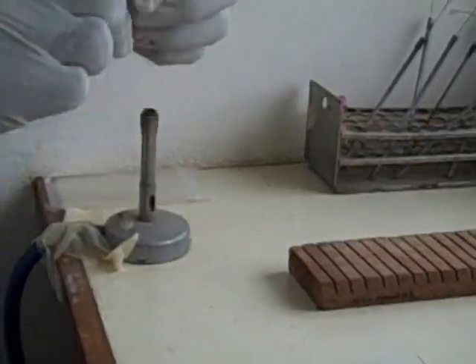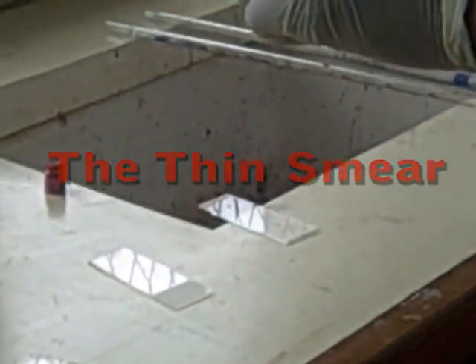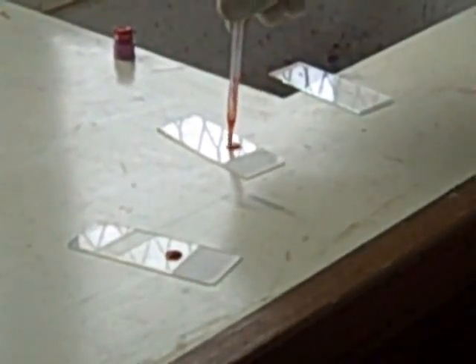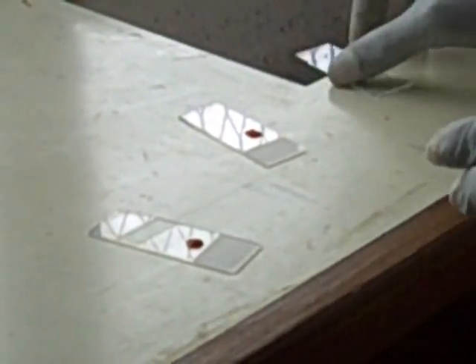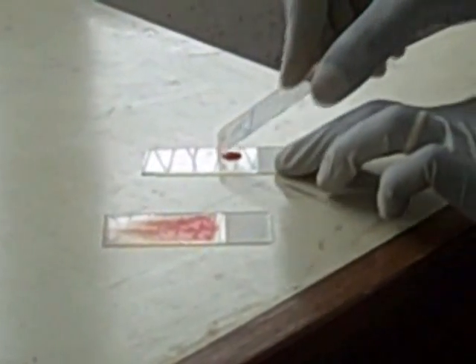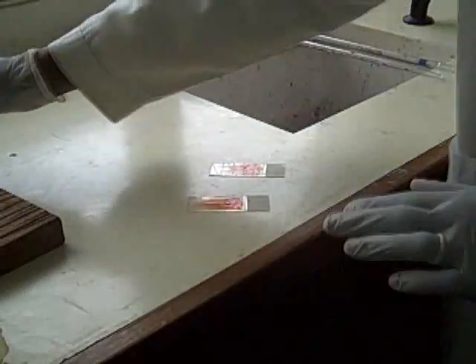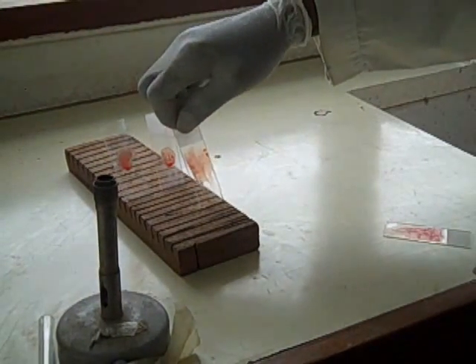Take a venous blood sample into a sequestrated bottle. Mix very well and take a drop onto a microscope slide. You can also take a finger prick from the third or ring finger. Using a microscope slide as a spreader, spread the drop of blood into a thin smear. Air dry the blood smear on a draining rack.